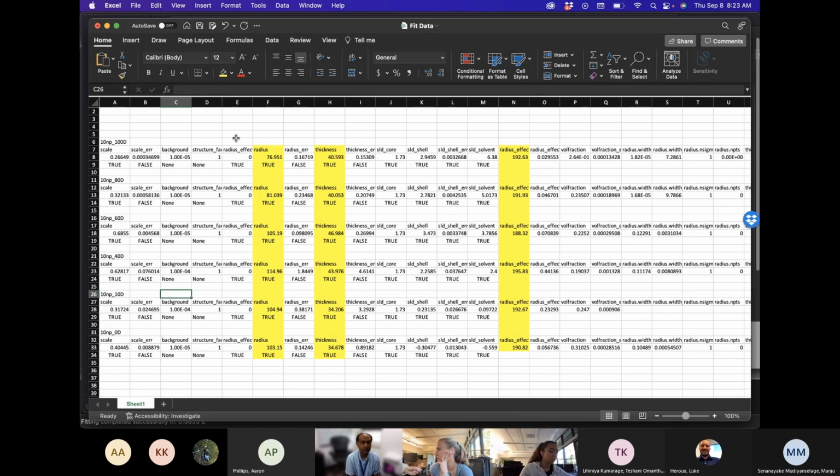We're also not sure, since it's made of both PEG and PLA, how the contrast match points may be different between those polymers. It's possible. Did I do a calculation for you, or did we calculate for PLA? We looked up the contrast match points for PLA and for deuterated water. We didn't do anything for the PEG part, but we're allowing for that. Oh, you're saying SLD, the contrast match points, like the percentage.